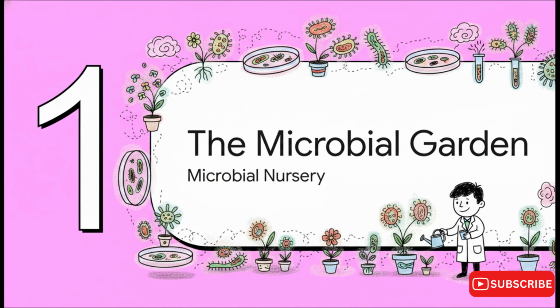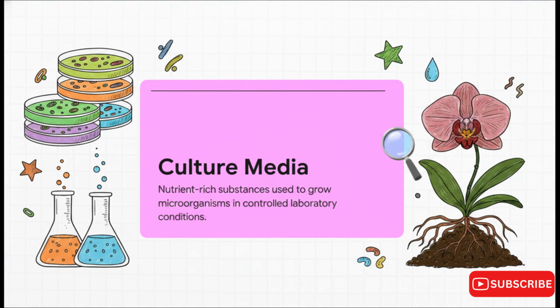All right, Section 1, the microbial garden. When we think of a laboratory, we usually picture cold metal and glass, right? But in microbiology, the lab is actually a nursery. So what exactly is culture media? In plain English, think of it as the specific soil that these microscopic plants need to thrive. Officially, culture media are nutrient-rich substances used to grow microorganisms in tightly controlled lab conditions.